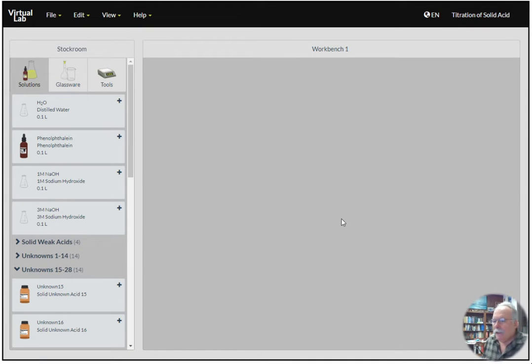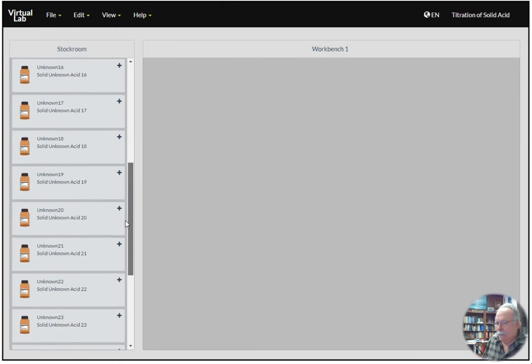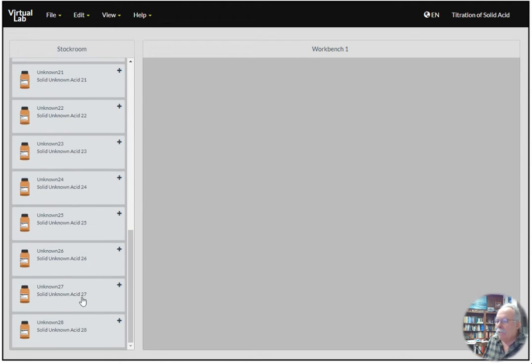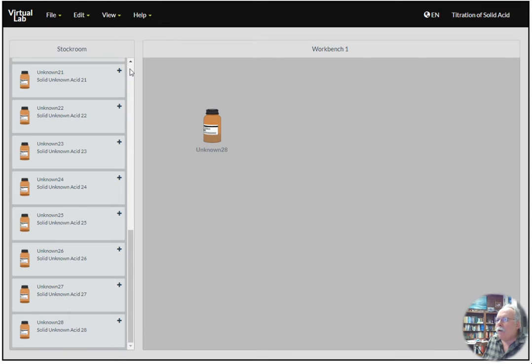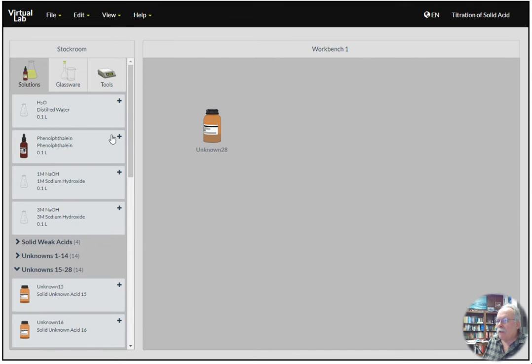Greetings. In this lab, we want to titrate a solid unknown acid, and the challenge is we don't know how much acid we need to titrate. So we're going to take some of this unknown acid, and we're going to find out how much of that would be required to neutralize 25 mils of the base.